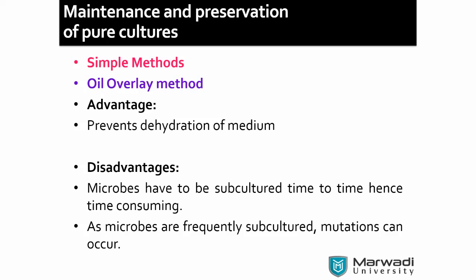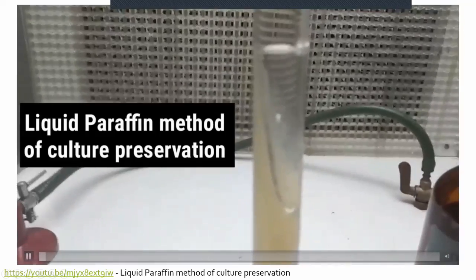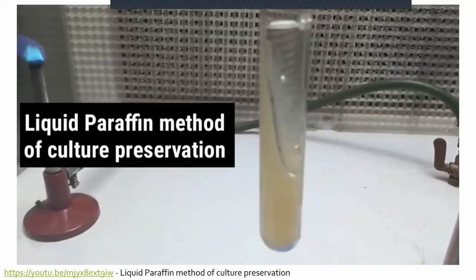But the disadvantage is that from time to time you need to subculture even here. And when microbes are frequently subcultured, mutations may happen. It is similar to the previous method, subculturing, but with an oil overlay, maybe we may store for a longer time period. So here one small documentary is there, let's see.